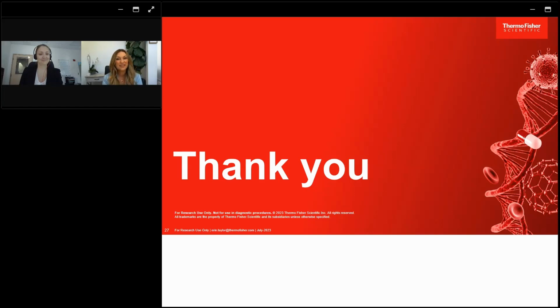Very good. Thank you. Our next question. So this one has a few parts here. Is the automated image analysis available in the Attune software? If so, which version? And can we have some instruction for adding the image analysis to the standard gating procedure?